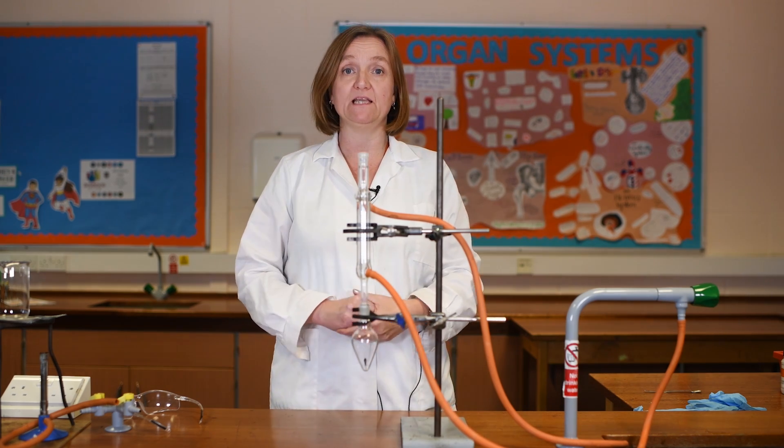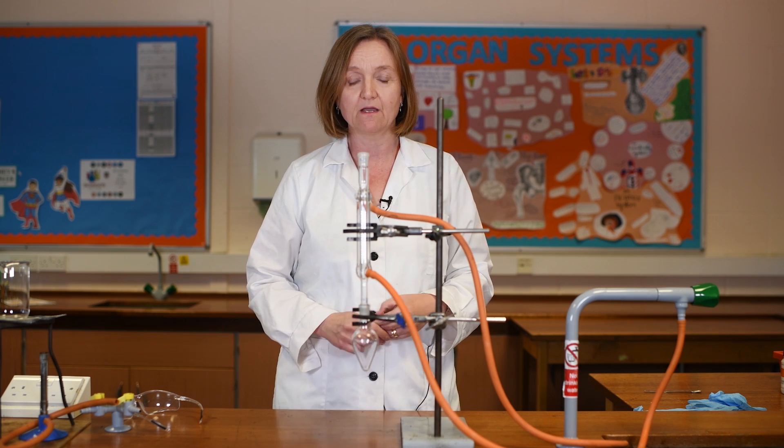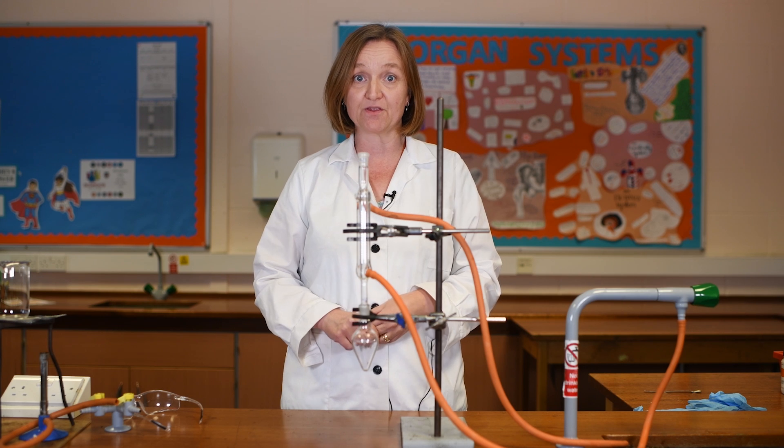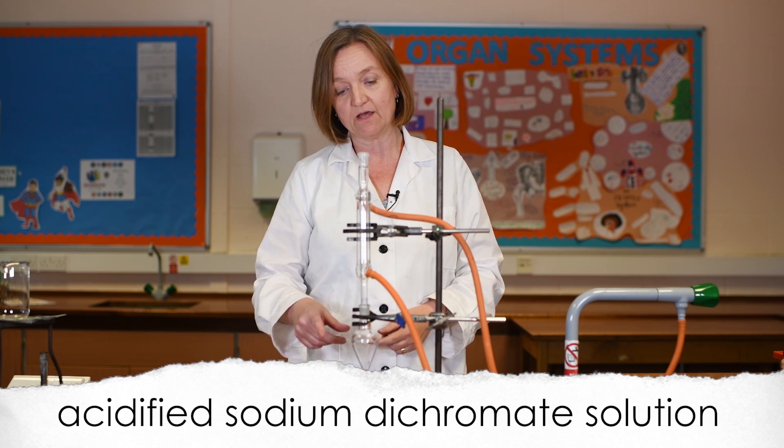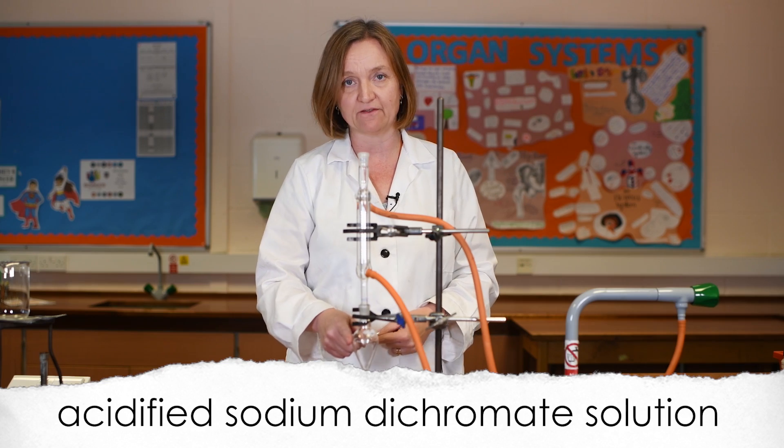This method is commonly used at A-level chemistry for the oxidation of an alcohol, and that's what I'm going to show you now. I'm going to oxidise ethanol using an acidified sodium dichromate solution that I'm going to place into my pear-shaped flask.